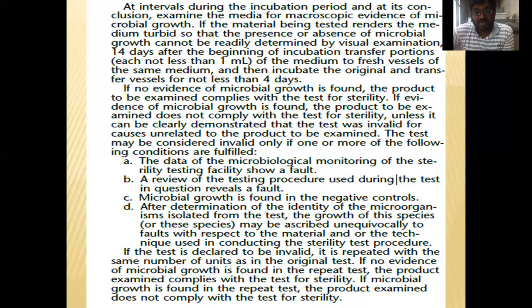So this is a very important test, and it indicates the compliance of the total pharmaceutical asepticness. Whether your system is healthy or not is detected by this sterility testing. Whether your handling is strong or poor is caught by this sterility testing. Thank you so much.